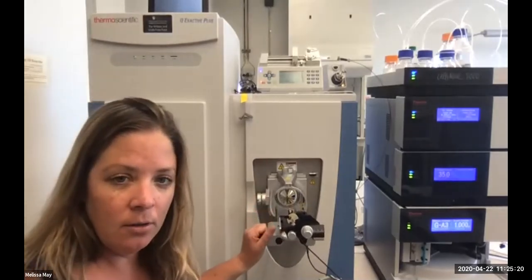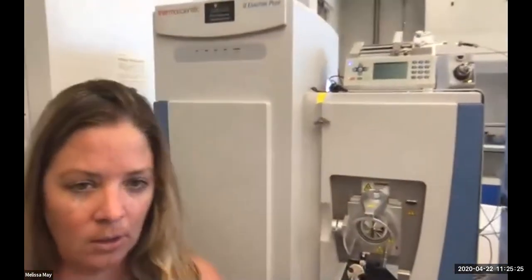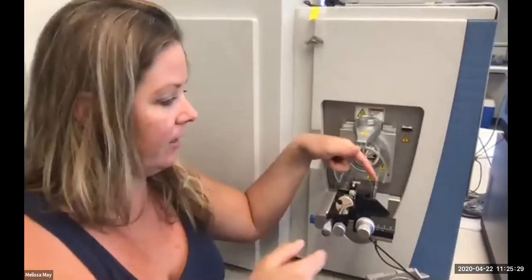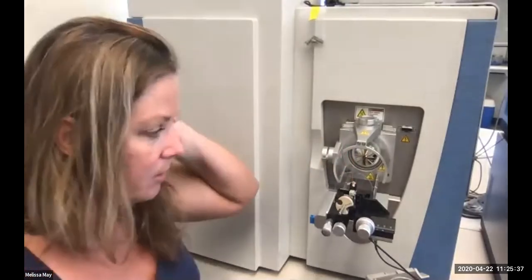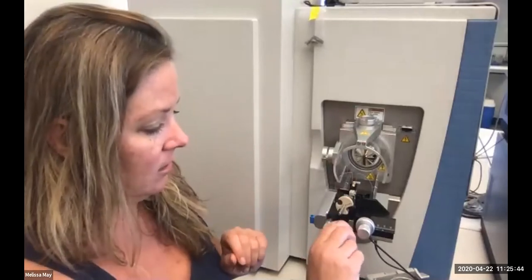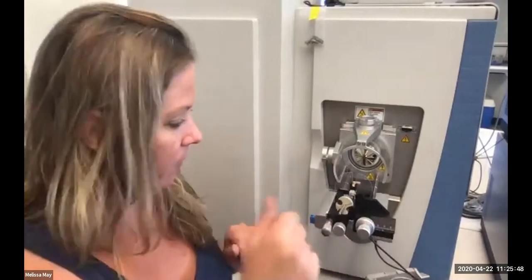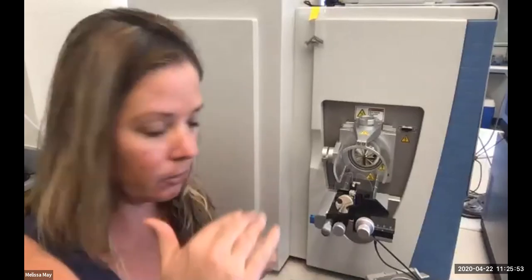You can pull this little tray out. It's going to be kind of hard to see, but this piece right here is where we actually put our column. The needle sticks in this part. I don't have it hooked up right now because we're not running any samples. You can adjust the position of this so that you have the appropriate angle spraying into the instrument. You can adjust the horizontal angle, up and down, and forward and back using these various knobs, and then this can manually be adjusted to change the angle.